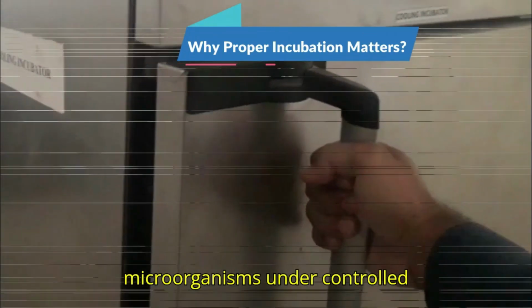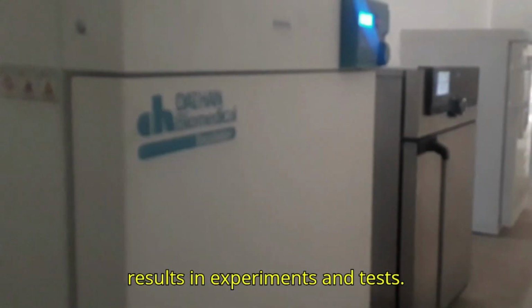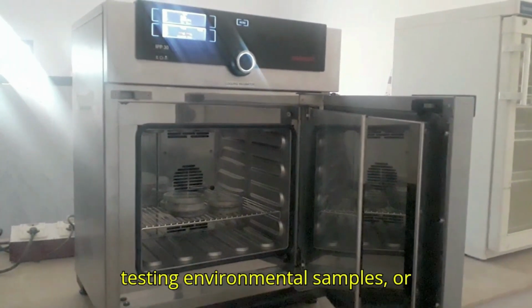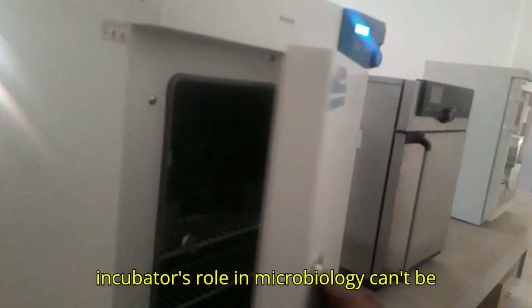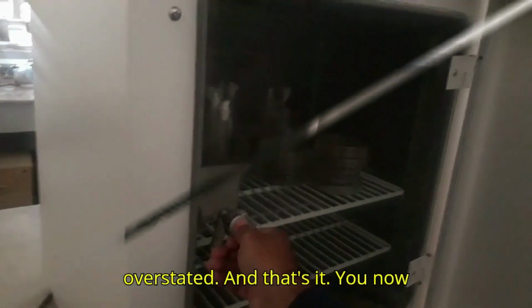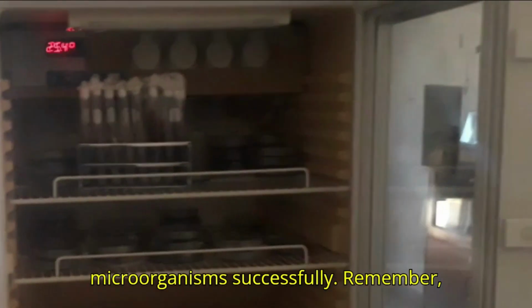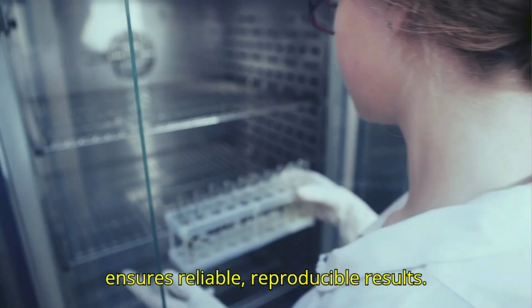Incubating microorganisms under controlled conditions is essential for accurate results in experiments and tests. Whether you're studying pathogens, testing environmental samples, or examining growth patterns, the incubator's role in microbiology can't be overstated. And that's it. You now know the basics of microbiological and BOD incubators and the steps to incubate microorganisms successfully. Remember, setting up your incubator correctly ensures reliable, reproducible results.